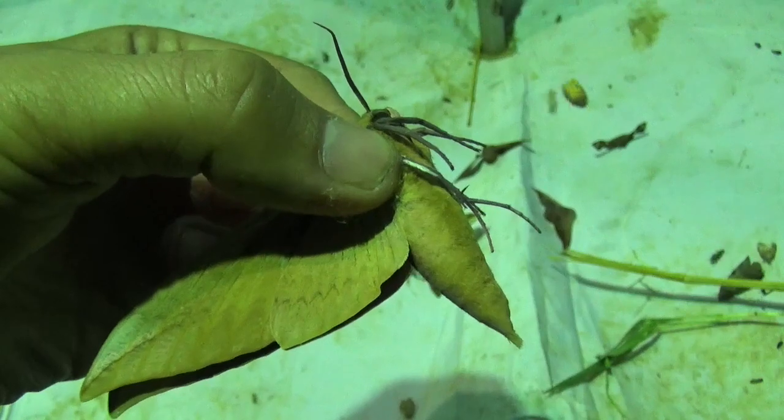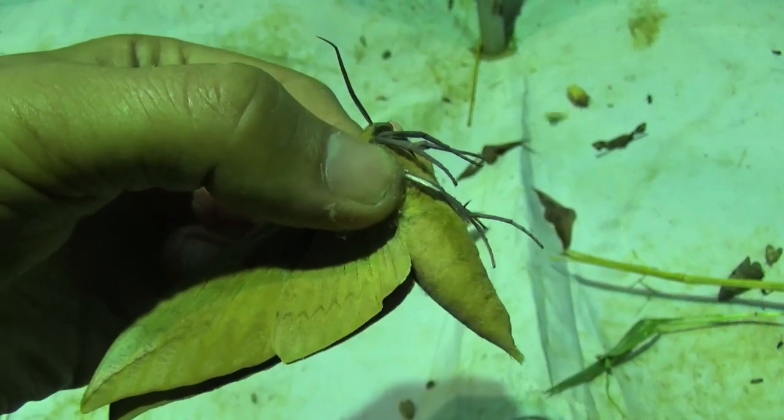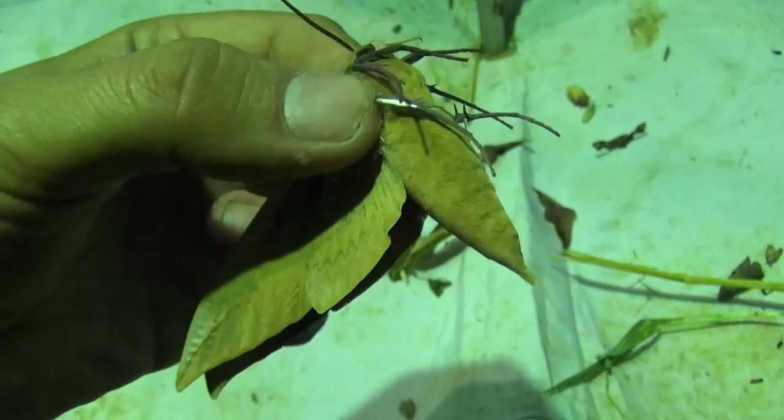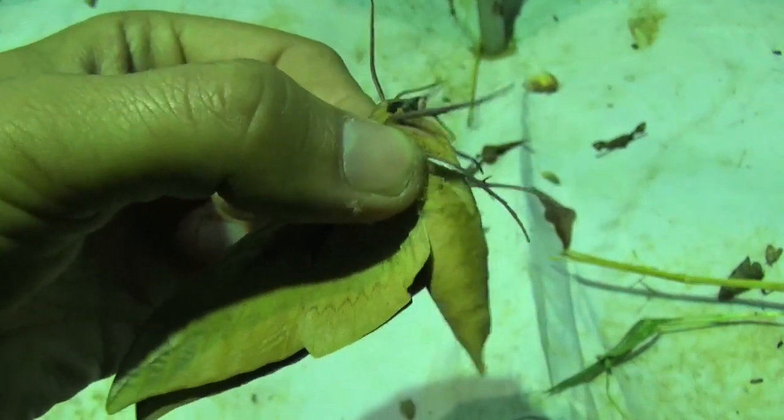This video is not here to debate whether killing insects is right or not. This is going to be a live demonstration, so if you are sensitive to killing, please turn away.